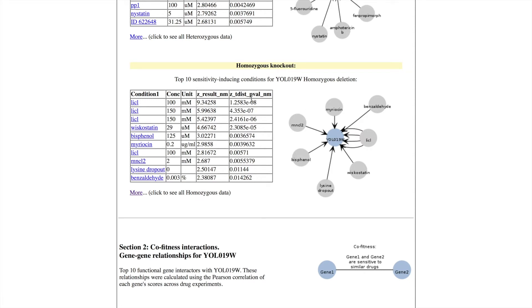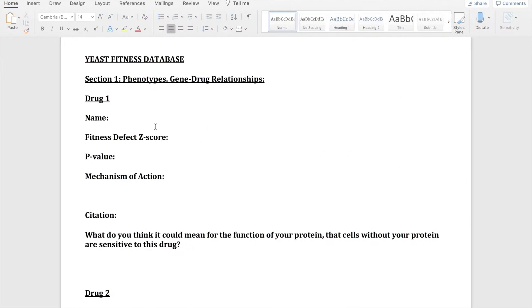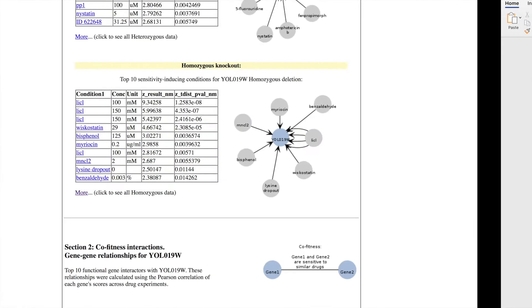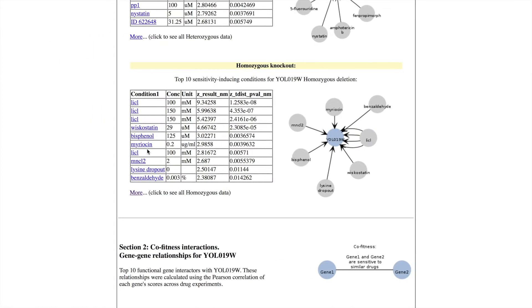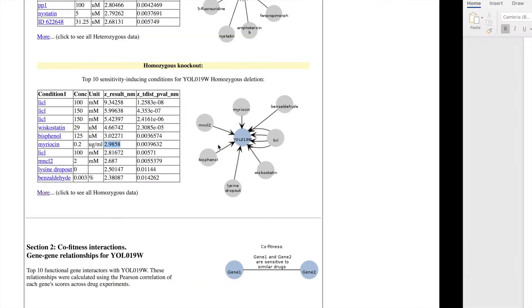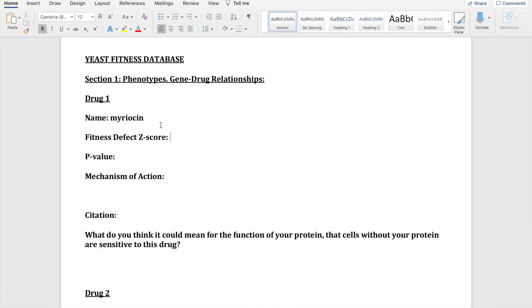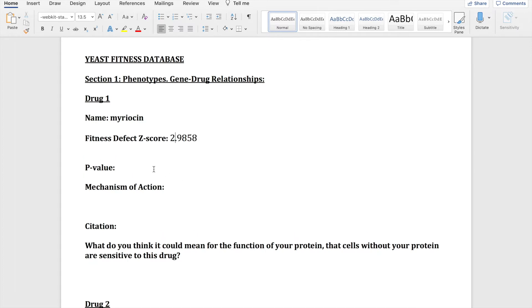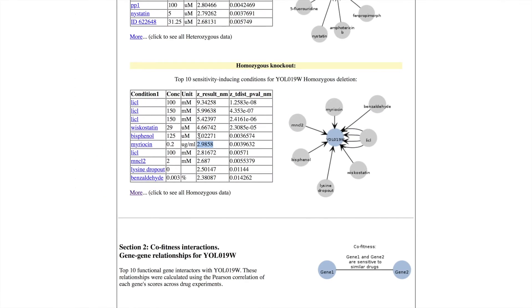So that is that column right there. We're going to be looking at myriocin and the z results. We'll copy from that section the fitness effect z-score for myriocin and paste that, and then the p-value we'll copy and paste that as well.